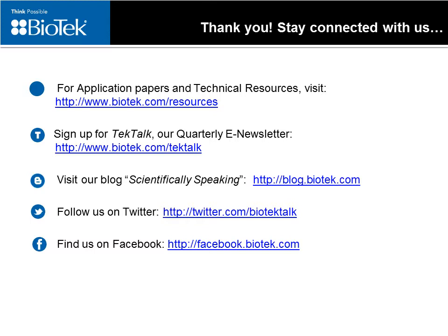Could this be useful for scratch assays during studying migration? Absolutely. High contrast bright field works very well for migration assays, for scratch assays in particular. And I would direct you to some app notes we currently have in development that will be available online shortly. But this technique works very well to characterize cell migration in treatments for a variety of cell types.